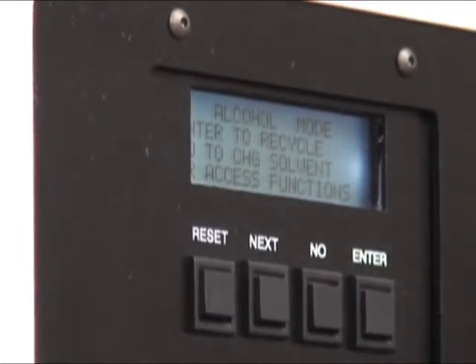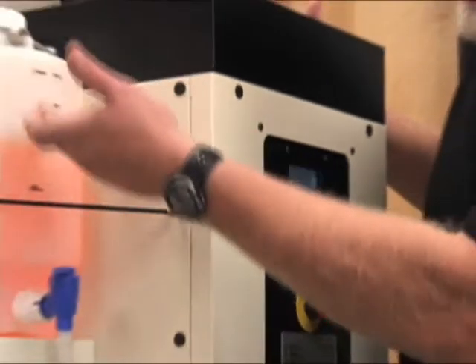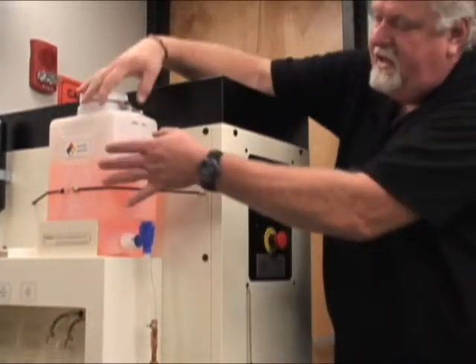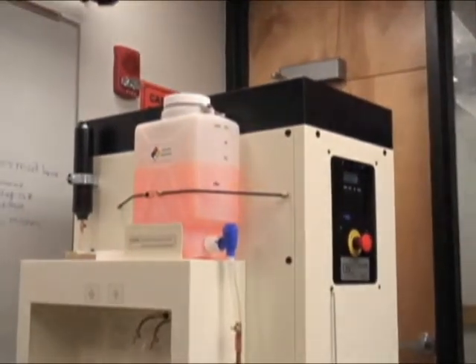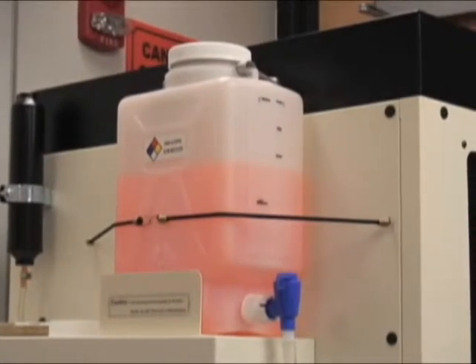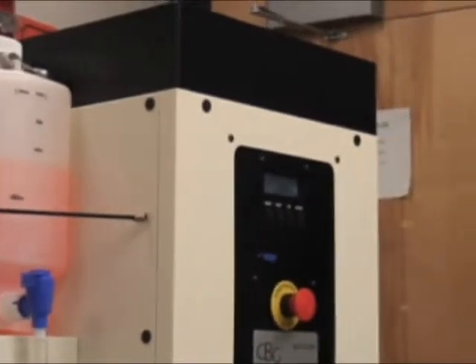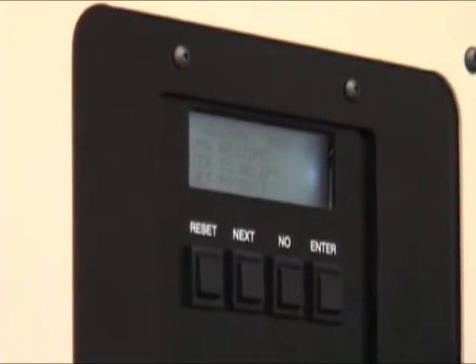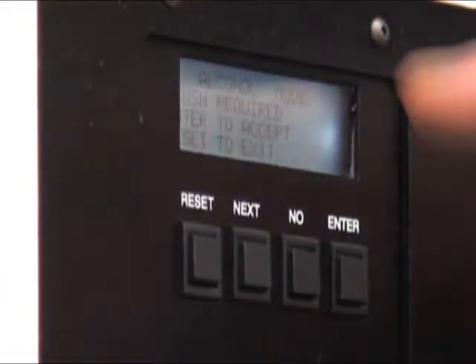From xylene to alcohol, it's going to make you flush. And what are you flushing with? A liter of the dirty alcohol you have in here anyway. These are gallon marks, these are liter marks — so basically this would be a liter. It's only on your first run, and then when you do your alcohols, you do them all together. This makes it very simple. So alcohol mode, enter to recycle. Flush is required — the machine knows it needs to flush, which is nice when you have multiple users and somebody forgets to tell the other person. So press enter.